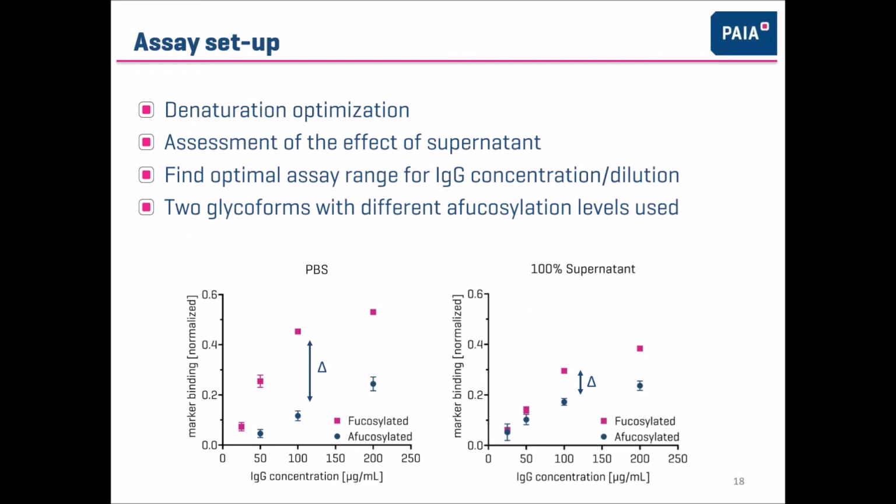I think one thing, if you're really looking at low levels of afucosylation and you don't see any binding, you can be sure that there's very low fucosylation in there. Also in static cultures, of course, good clones should be in the range of 50 to 100, right? So typically clones maybe at the 6-well stages. Yeah. No, thank you. Appreciate your help.